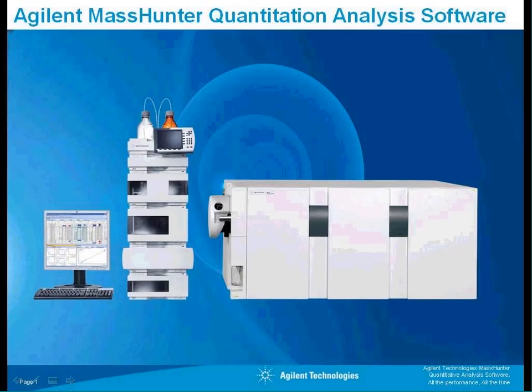The situation is where you have a target and you'd like to find a qualifier, and you have a chlorinated compound or a brominated compound.